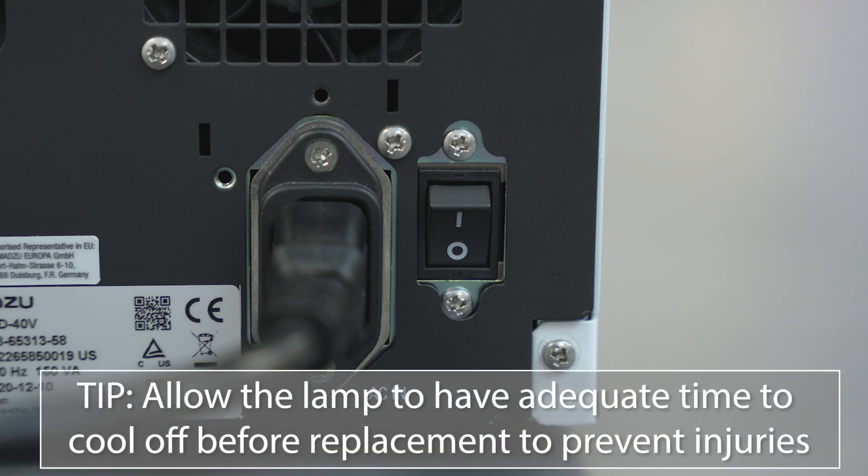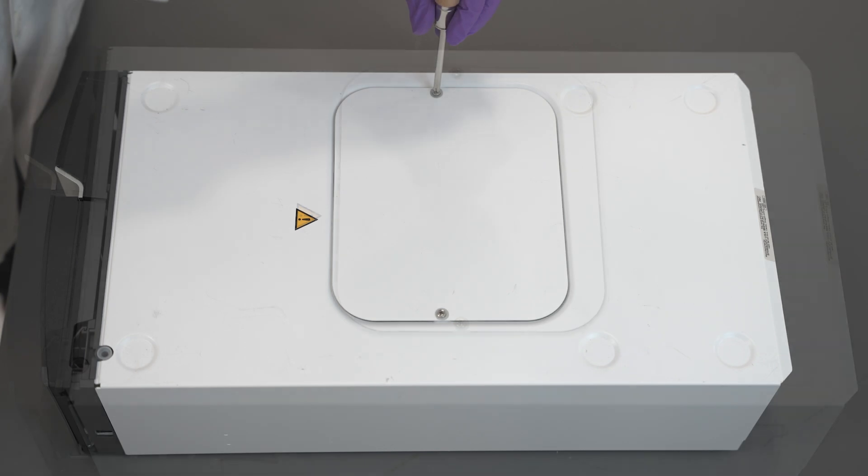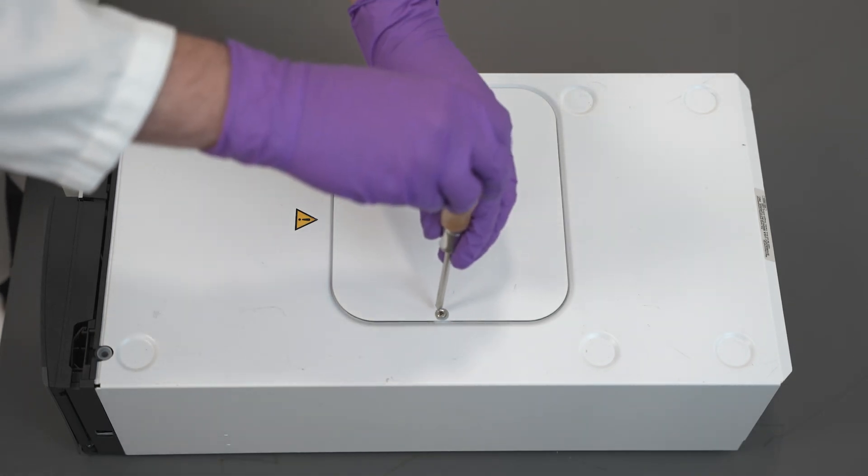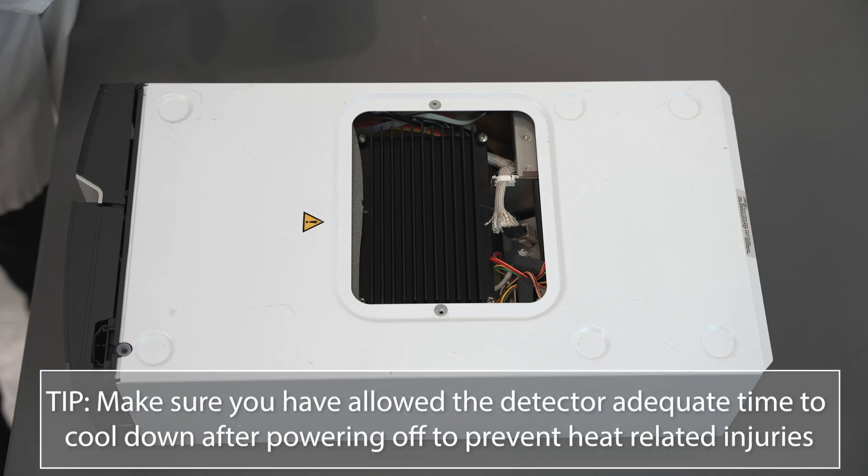Allow the lamp to have adequate time to cool off before replacement to prevent injuries. Remove any reservoir trays or modules that sit on top of the UV-Vis detector so that you can access the top cover. Loosen the two screws and remove the top cover. Make sure you have allowed the detector adequate time to cool down after powering off to prevent heat-related injuries.